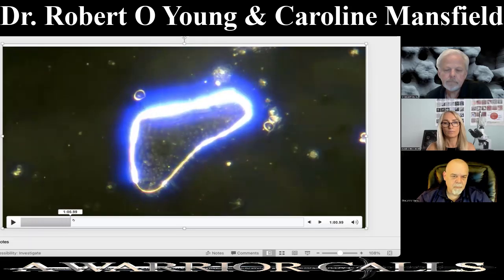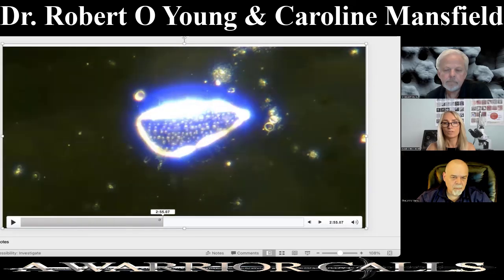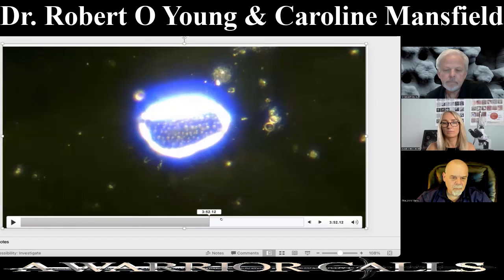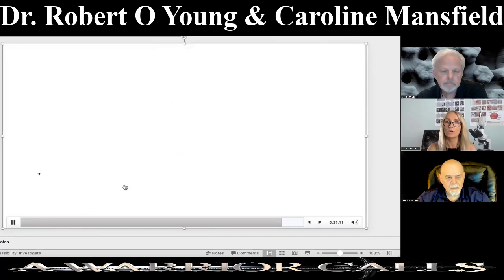here we go, starts to actually just deflate like a balloon. So that was an interesting observation as well. And as I say, it's just all observational. Potentially because it's marine sea plasma, I don't know, it's high in salt, and hydrogels are known to hold water. Potentially it dehydrated it.